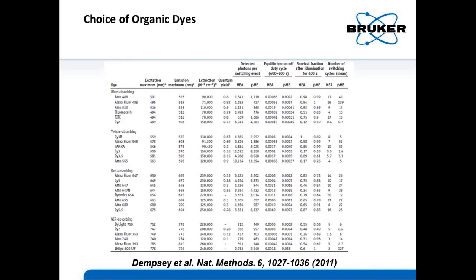Apart from that, there are a lot of other fluorophores available, and in some situations, depending on the biological system you're using, you can use these other ones and try to optimize. So you're not limited. The ones I showed you earlier are the ones I prefer because I've worked with them a lot in a variety of biological systems, and they're very dependable.